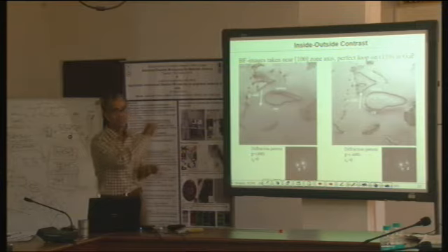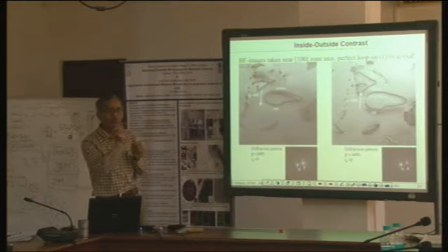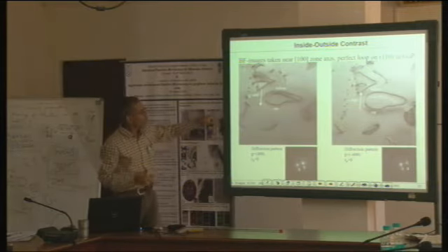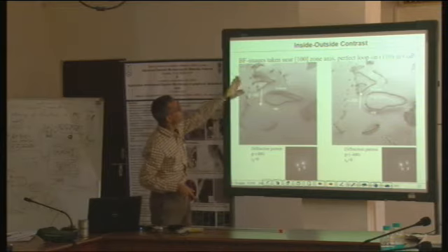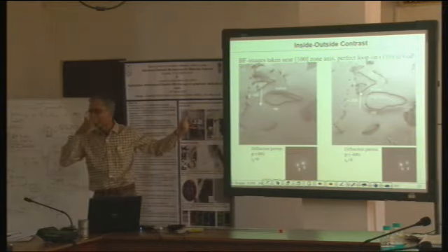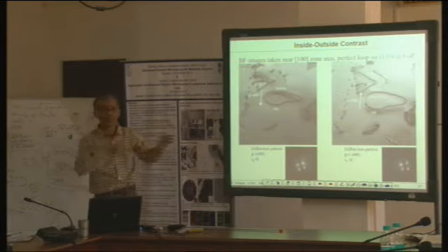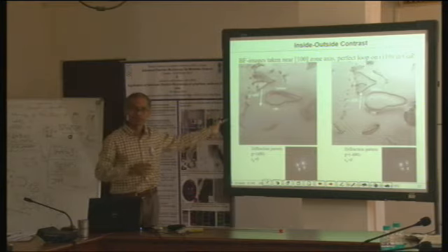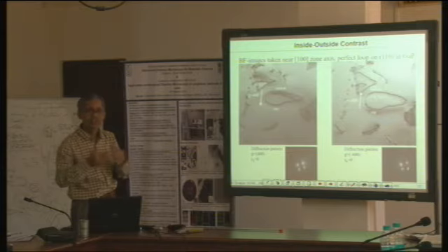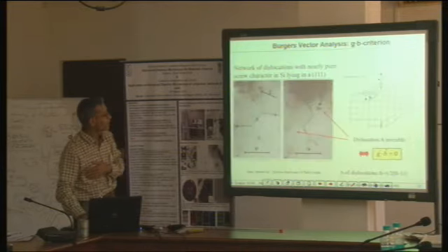You have to go a little bit into how it is really affecting the diffraction conditions locally. Actually, there is much more to it. It is also possible to find out which of the two kinds of stacking loops it is, whether intrinsic or extrinsic stacking. But let's not go into the details. I think you have understood the philosophy of how it is done, and specific cases can always be handled.